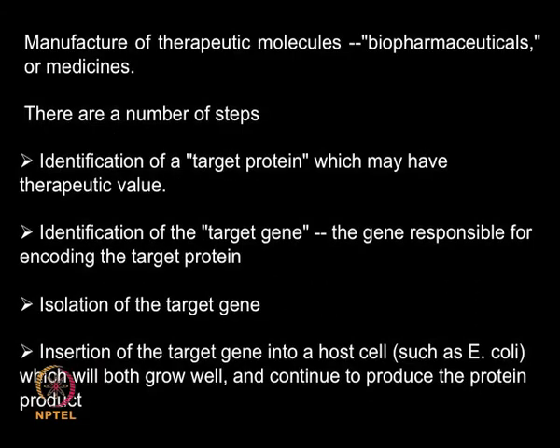Now let's look at a therapeutic molecule, for example, a biopharmaceutical or a medicine. How do we go about deciding on a chromatography based separation?